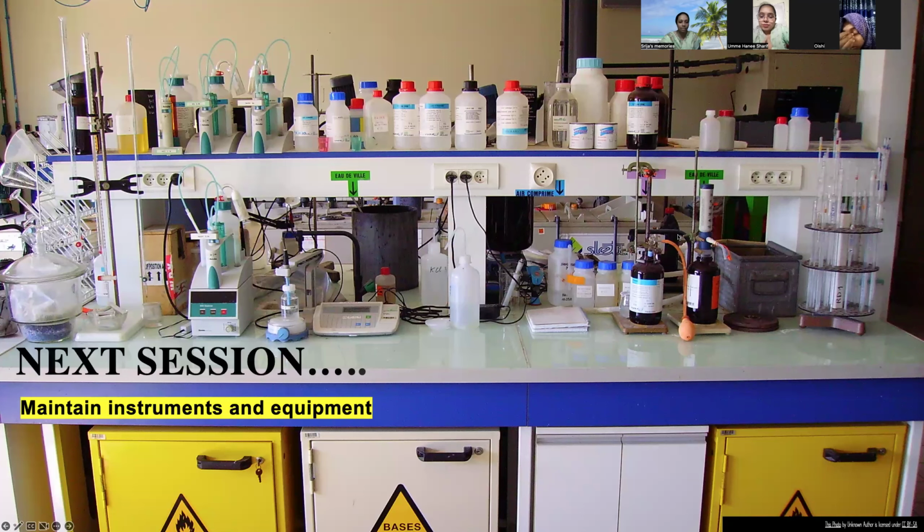So our next session will be about how we maintain instruments and equipment in the laboratory. It's very important. When you start your job in a laboratory, we usually assign some people to do the sample collecting, some to work in the laboratory, and some to transporting.